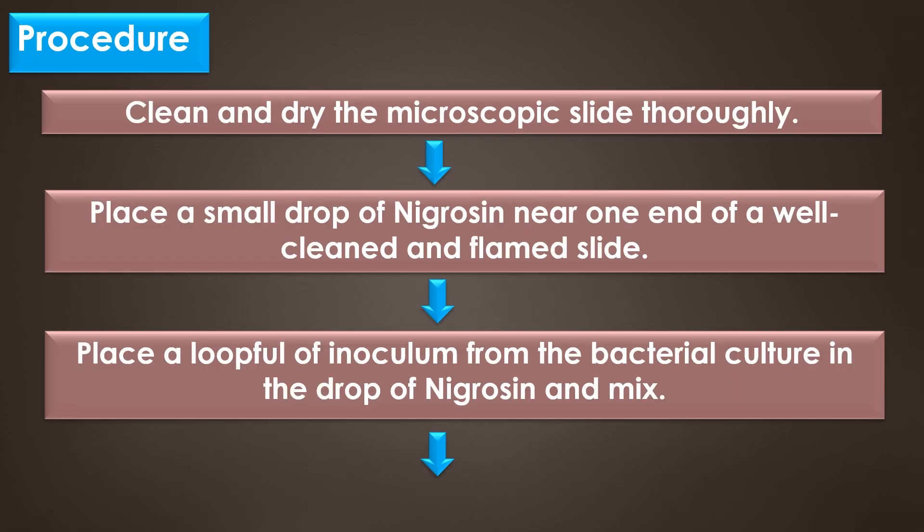Procedure. Clean and dry the microscopic slide thoroughly and then place a small drop of nigrosine near one end of the well cleaned and flamed slide. Using aseptic technique, place a loopful of inoculum from a bacterial culture in the drop of nigrosine and mix it well.